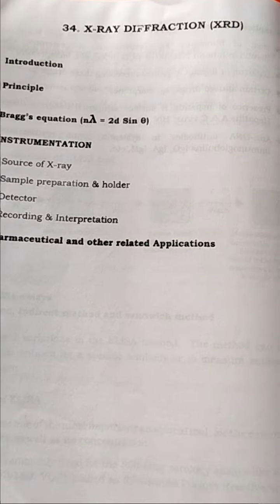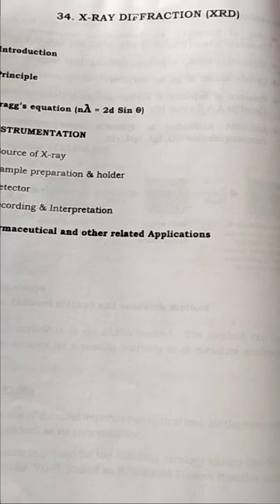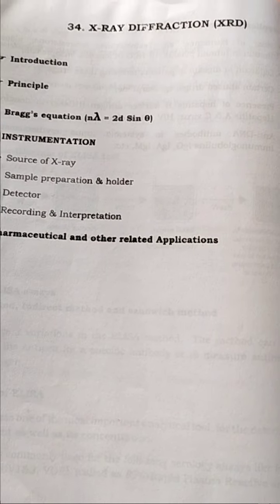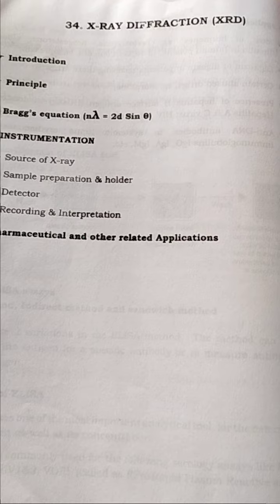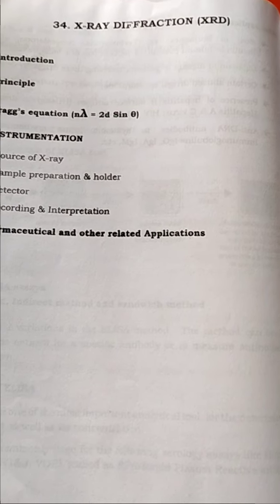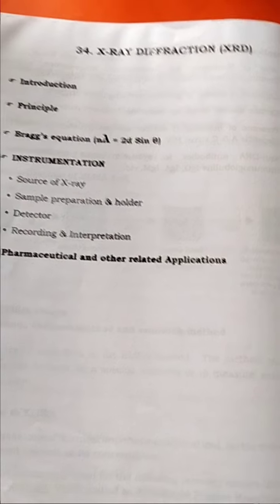X-ray diffraction is a technique used for qualitative analysis and for detecting the internal structure, that is, the structure elucidation of organic and inorganic compounds.